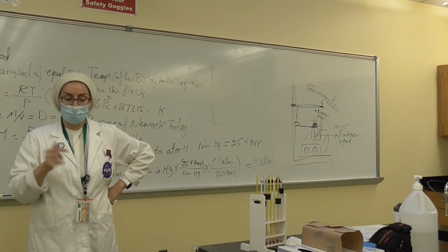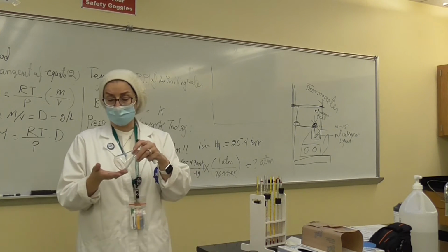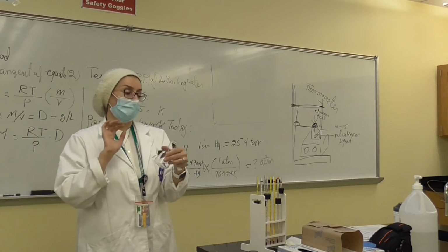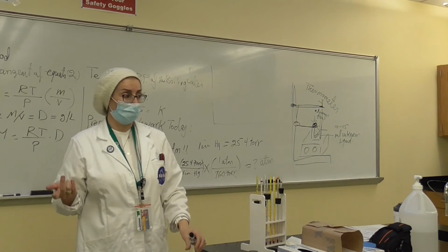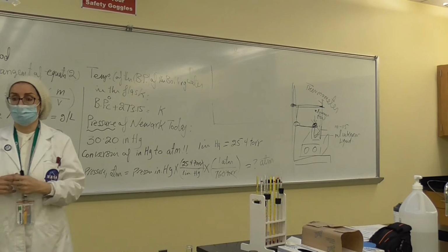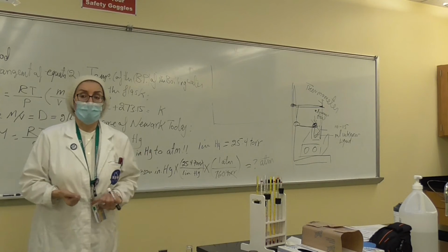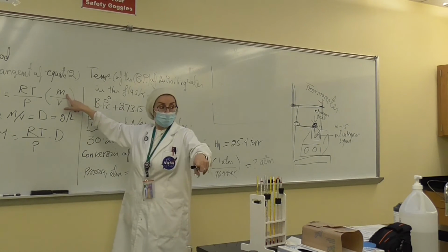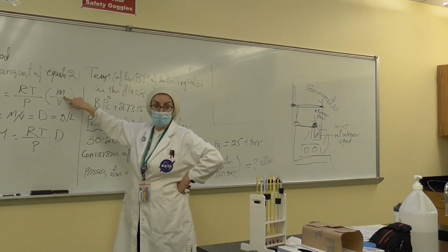You need to take off the weight of everything that you have, which is the container, the foil, and also the boiling chip. Because we don't need it. We need only the condensed liquid of the volatile gas, okay? So this is what we're going to do. Once you are done, this is going to be the mass of the condensed liquid. That's the mass of your unknown.